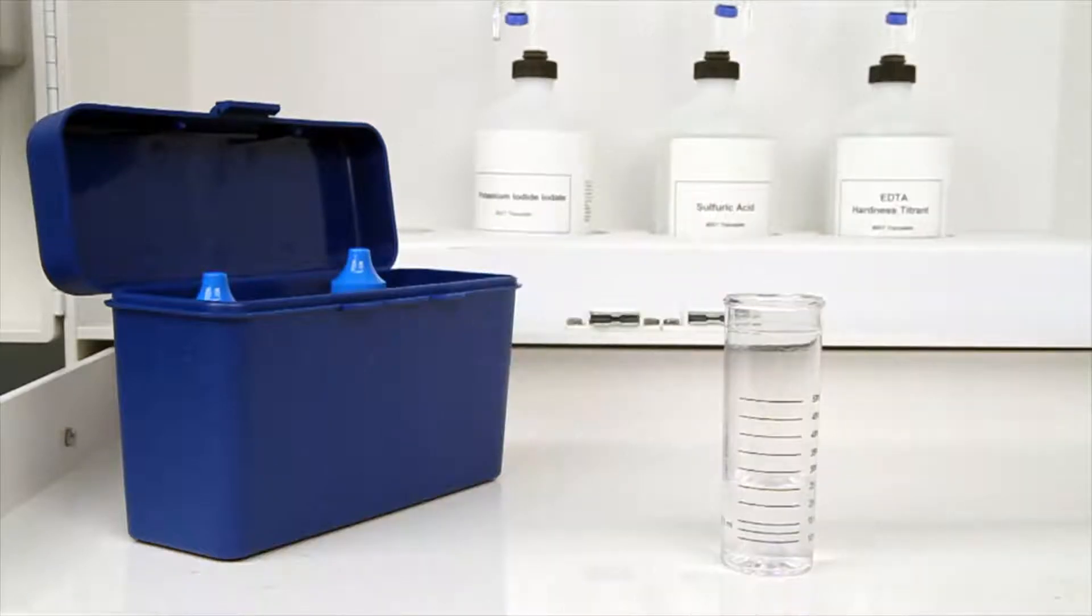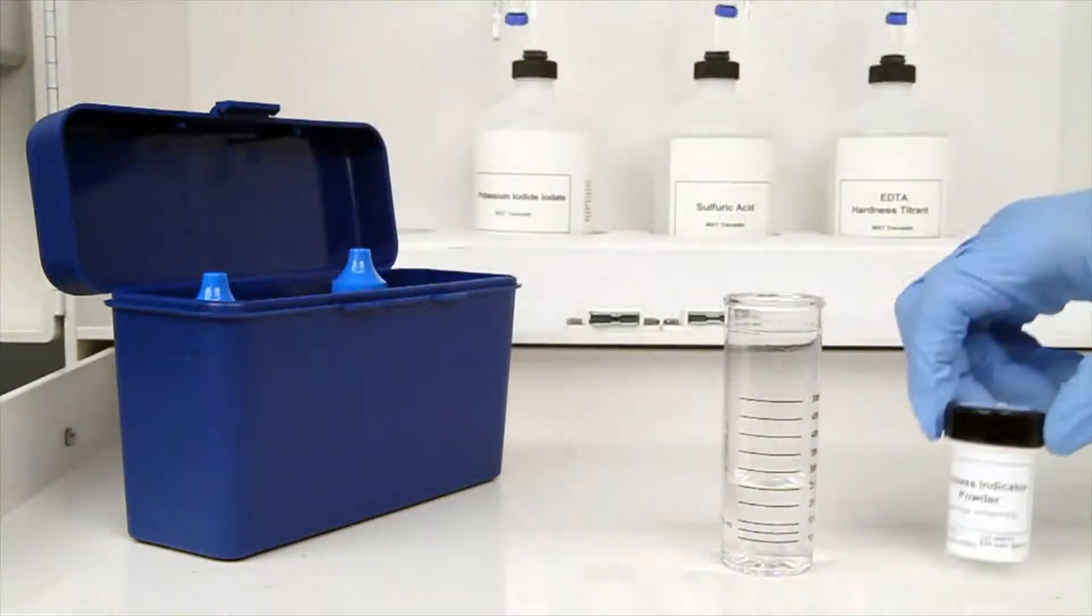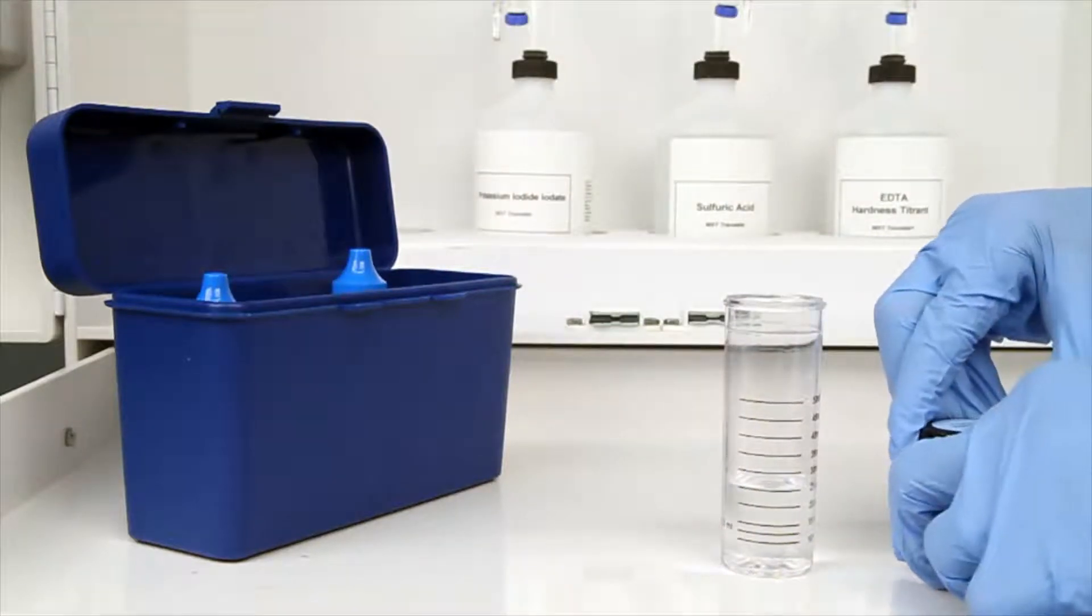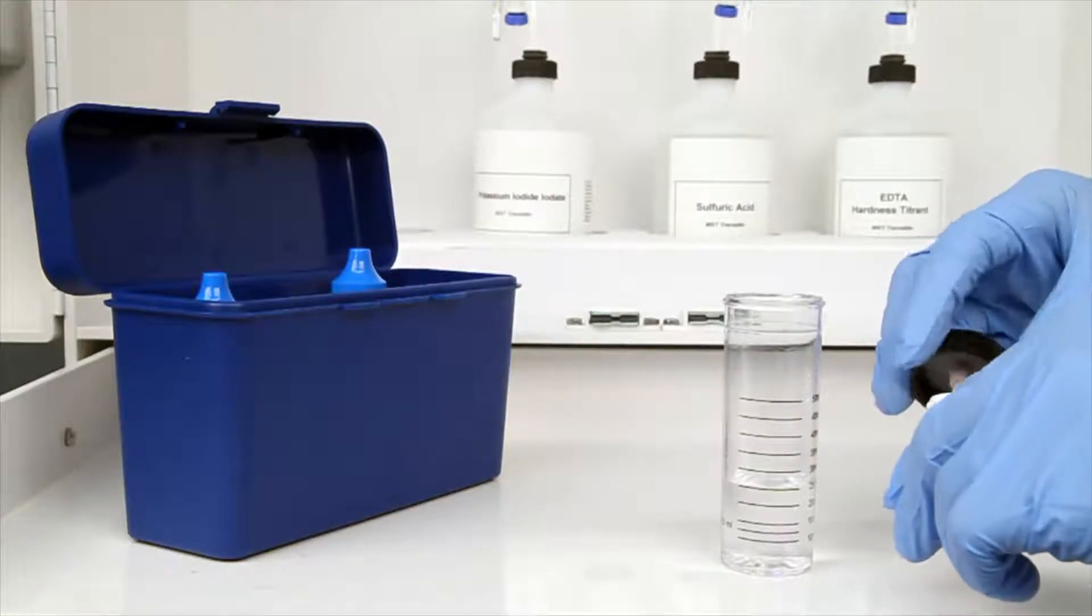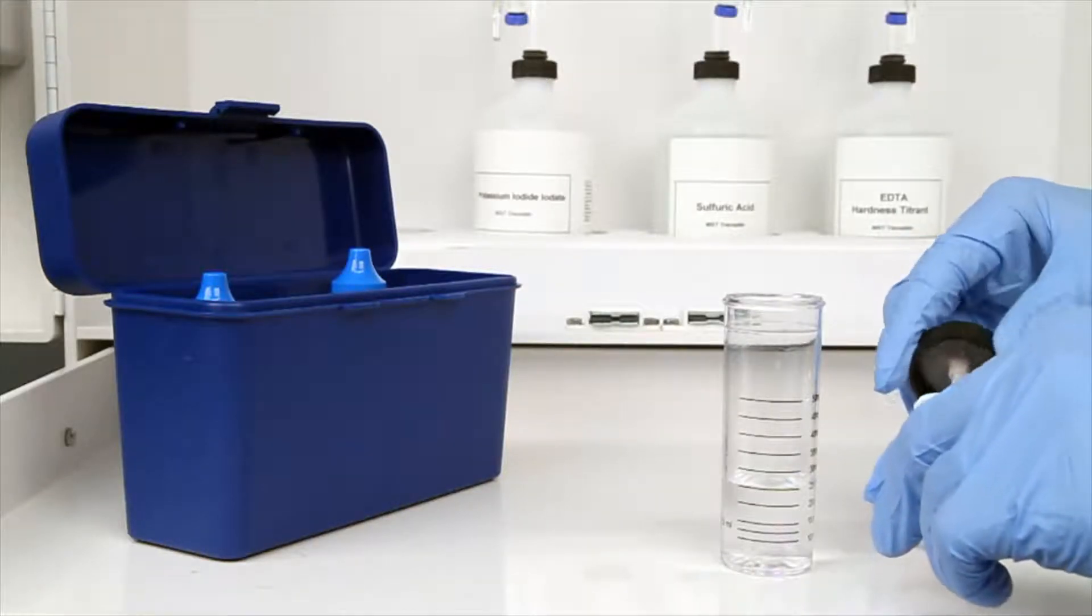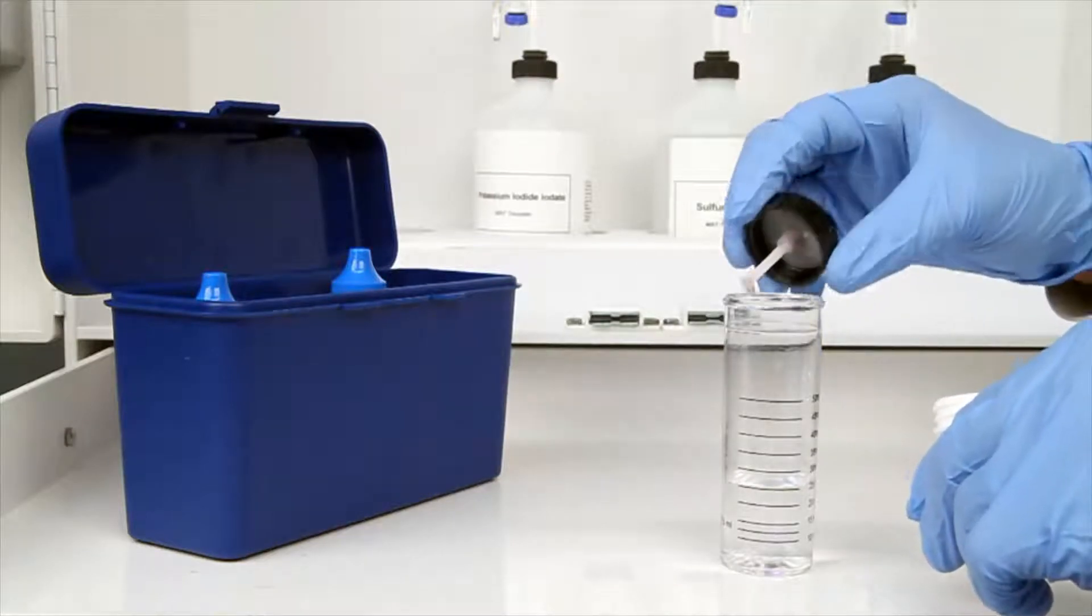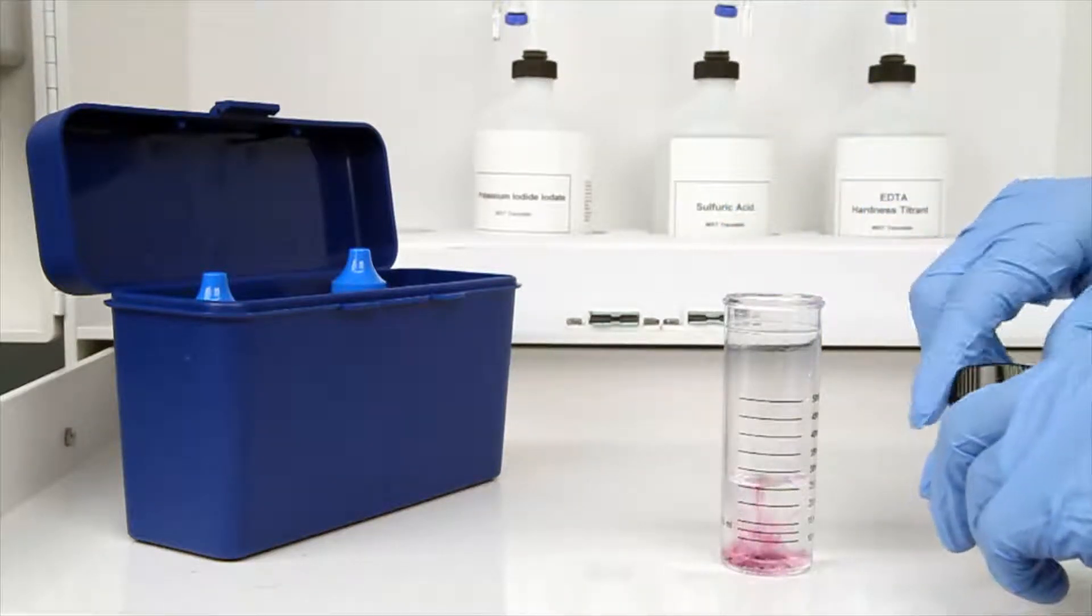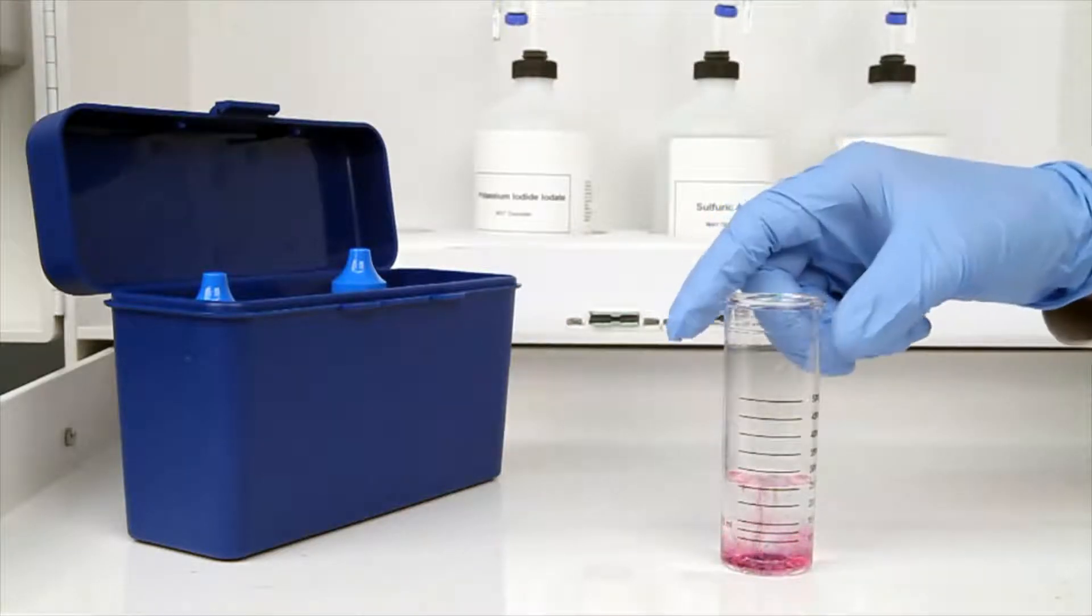The next step according to the Endpoint ID procedure is to add one scoop of hardness indicator powder. After the addition of the powder, swirl the vial to ensure the powder is completely dissolved. In this case, the sample is turned red, indicating that hardness is present.